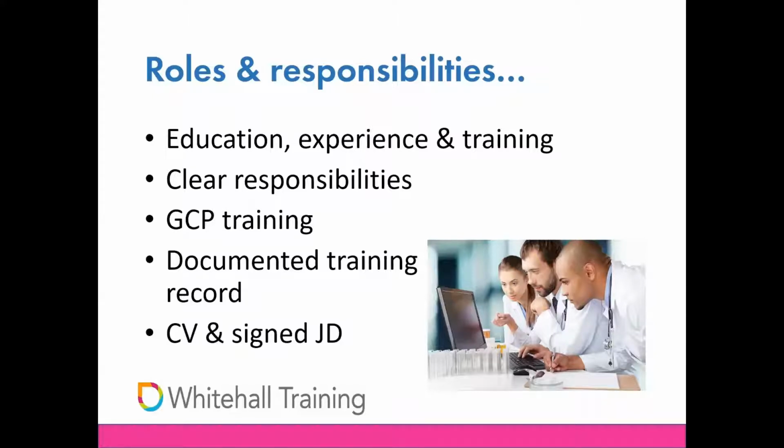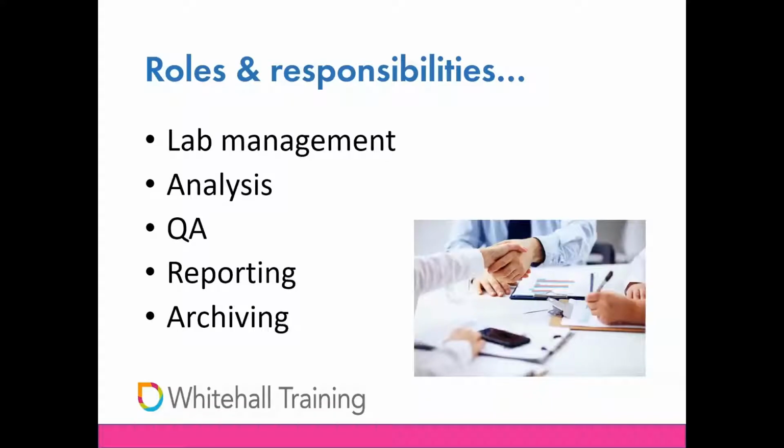Ideally, training records should be reviewed on a periodic basis by lab management just to make sure that they're still current and relevant. And this review should, yep, you guessed it, be documented. This could form part of an organization's performance review process. When people leave the organization, it's management's responsibility to ensure that a copy of this training documentation is retained for the records.